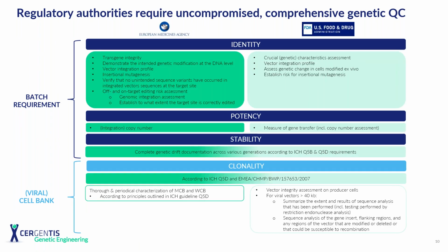In this overview table, we summarize the key characteristics that need to be looked into as recommended by guidelines from the FDA and EMA. So basically, these regulatory agencies want to ensure that all biologics are of the highest quality. Therefore, testing specific critical quality attributes that have an important influence on the consistency and safety of a product is mandatory.